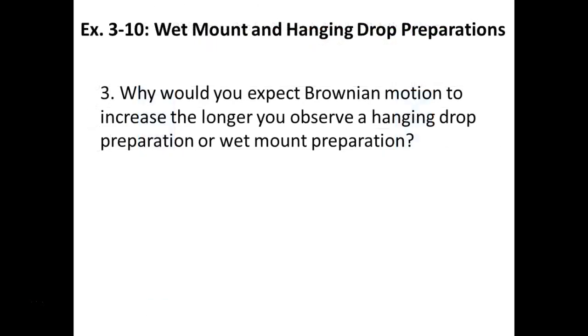So why do you expect Brownian motion? This is all about heat. Why is this going to increase the longer we leave that slide sitting there? The light, right? Especially these old microscopes have halogen light bulbs. They get hot, so the light source is going to heat up that slide and create more vibration.